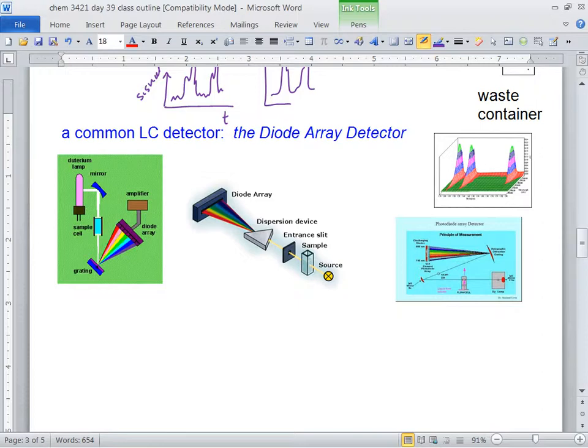So I have kind of like the red is on the furthest on the right, and the green looks like it's detecting green furthest on the left, right? So all this is fixed. It's not jiggling around or anything. This is a fixed thing. It's measuring all wavelengths at the same time. And then your sample is just going in between here. So if it absorbs red, well, then a little bit of the red's going to be attenuated, and that solar cell would detect it.